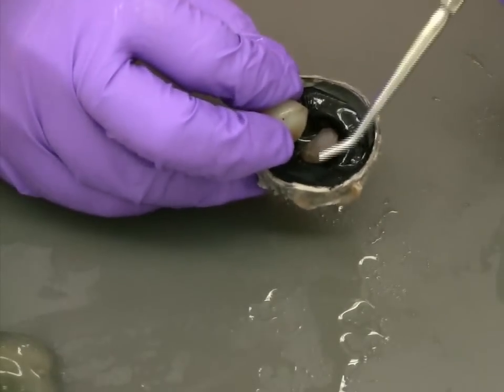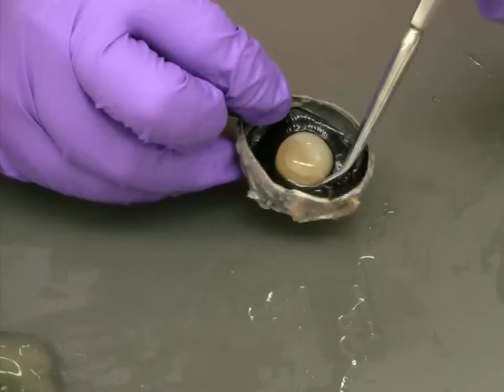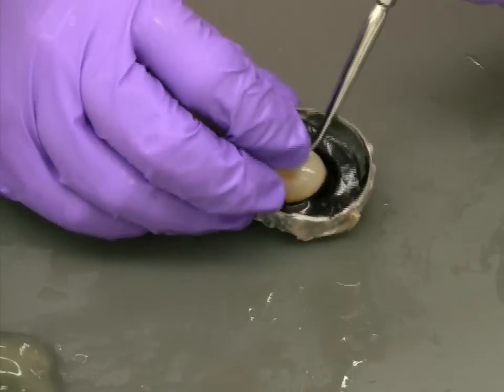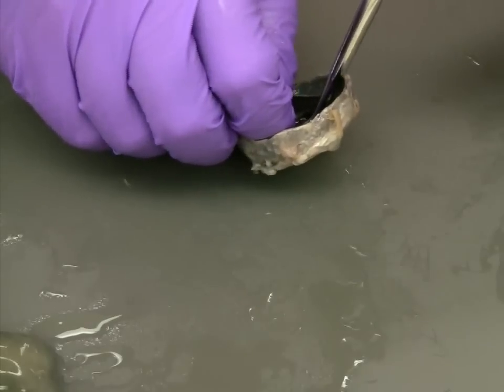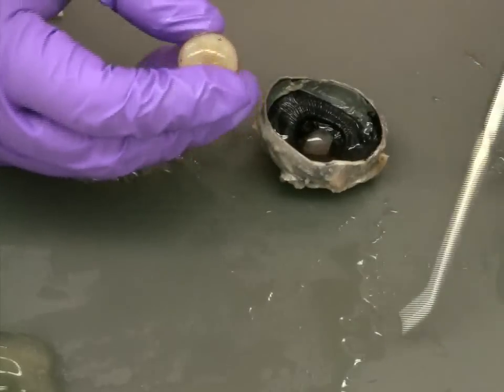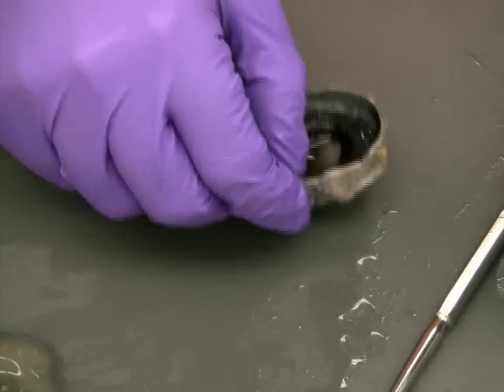At this point, you'll also be able to expose the cornea, which may be cloudy due to the preservative. As you work on removing the lens, you'll note that it has a yellowish, cloudy color. This is an artifact of the preservation process and is normal in a preserved eye.